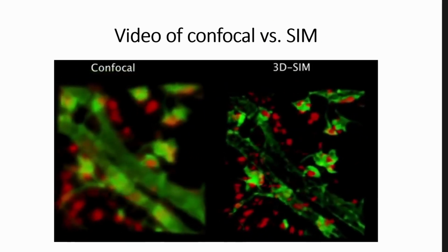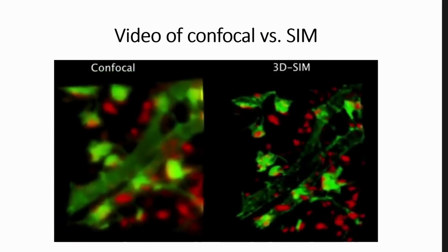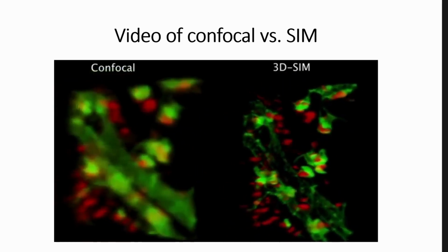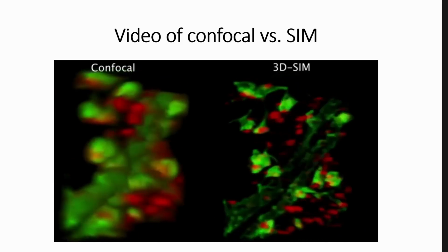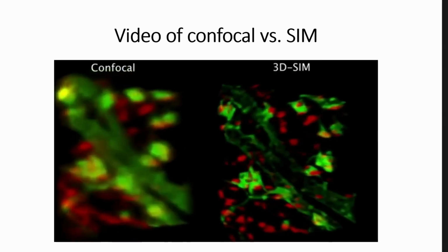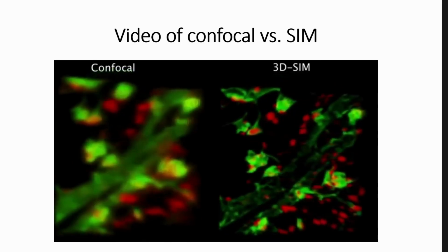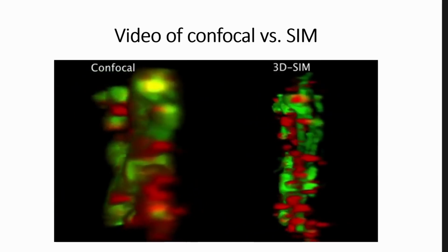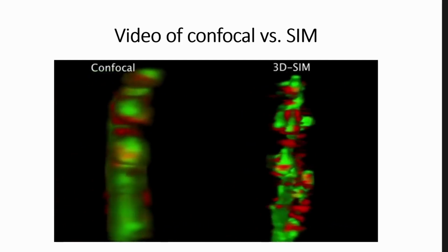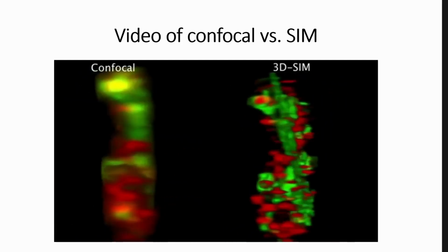There is no reason why you couldn't do two-dimensional or three-dimensional or time series. This is a confocal image. This is a single image. So you get, like I said, approximately twofold resolution. Optical sectioning systems, which are very frequently found in clinics, research institutes, etc., like I said, are a cheap version of the confocal microscope. They are built exactly like that. They use an illumination light source, diodes for example. They use a pattern in the light path and they shift and rotate.